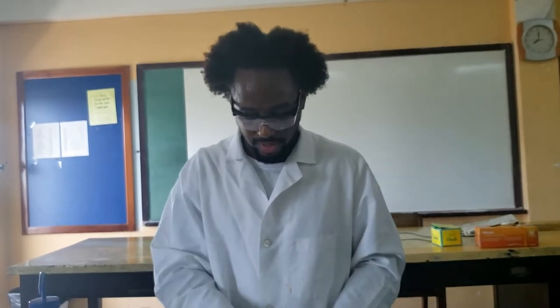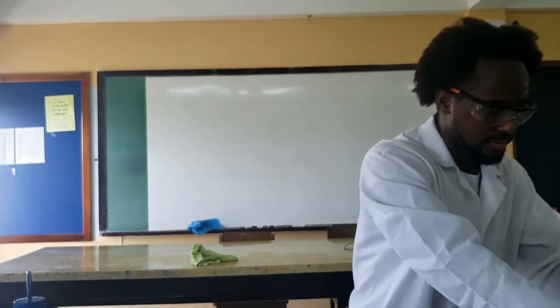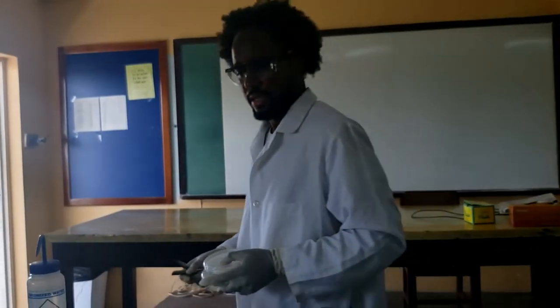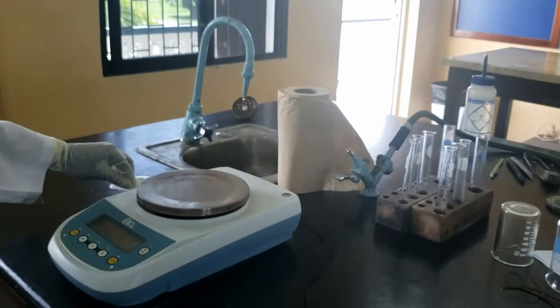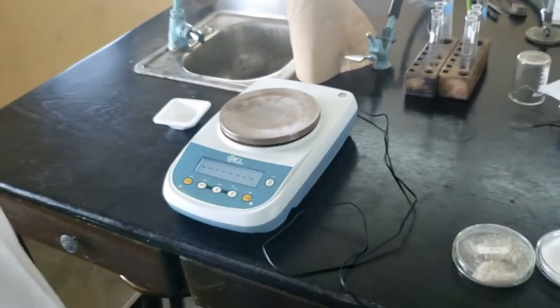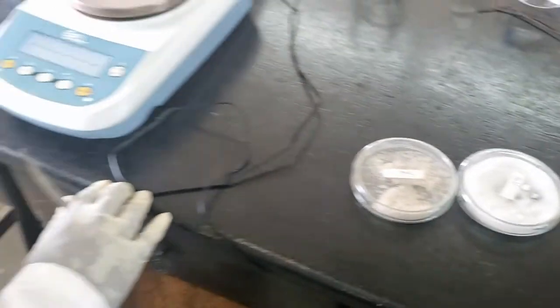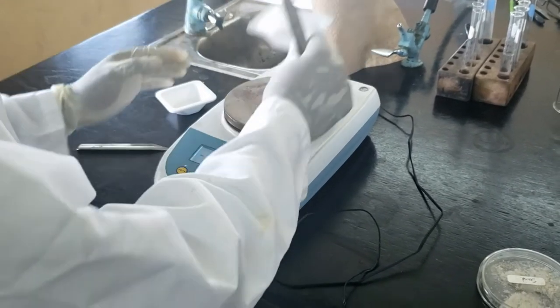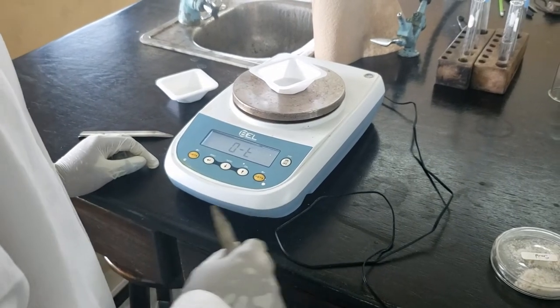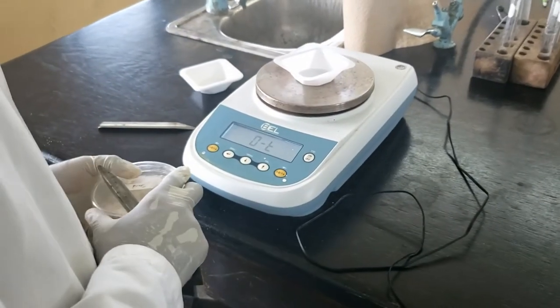Next, we are going to use the scale and combine one to two grams of sand with one to two grams of salt. So we have our sand and our salt with spatulas. Here we have our electronic balance — turn it on, wait for that to calibrate. We add a weighing boat onto the electronic balance and we normally just zero it, so that we don't have to worry about the mass of the weighing boat. That tares the scale.